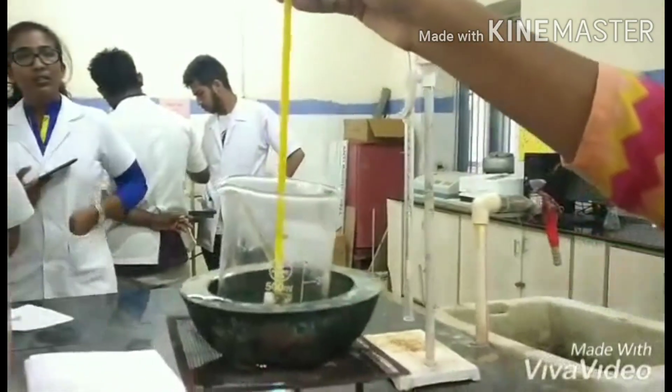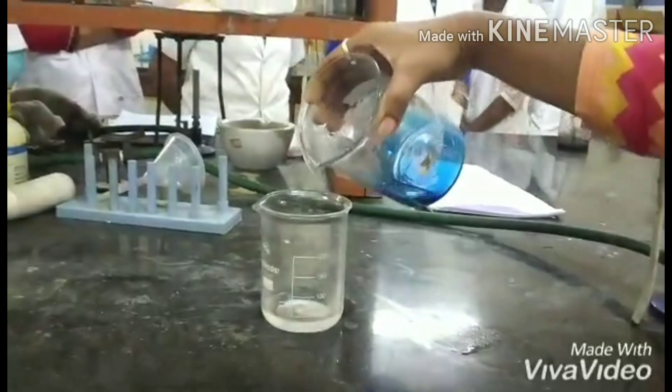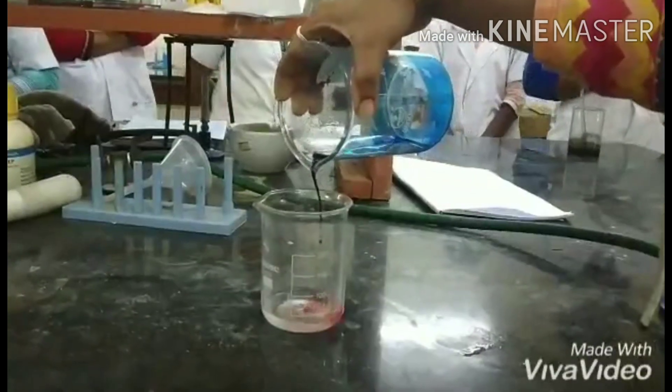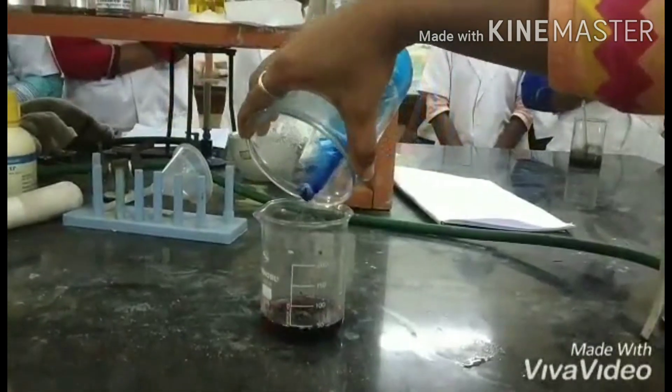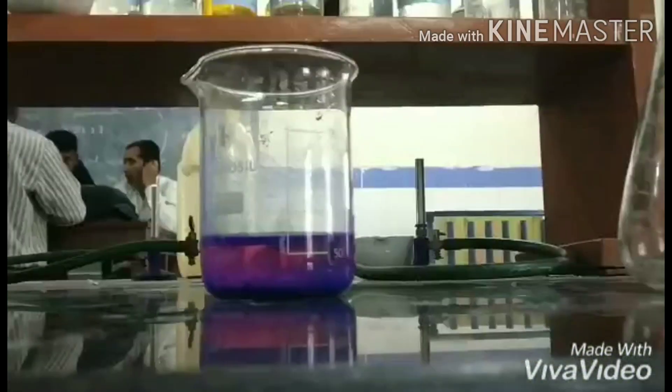The boiled mixture is poured into the beaker containing mercury chloride solution, and the mixture is allowed to settle down for a few minutes.